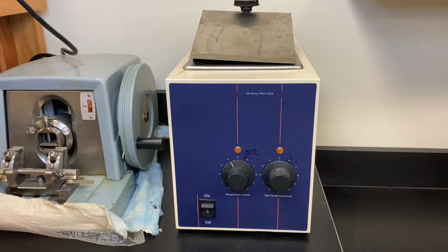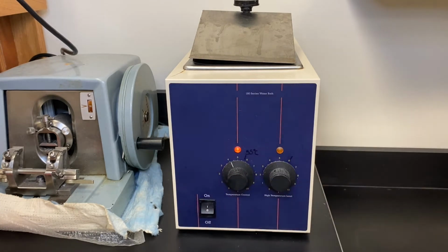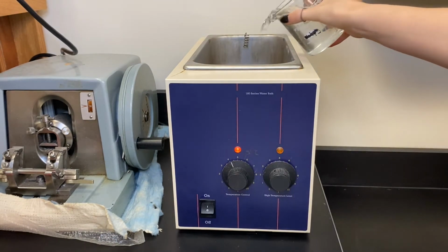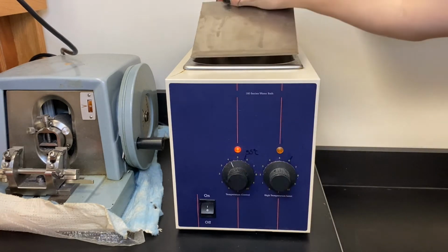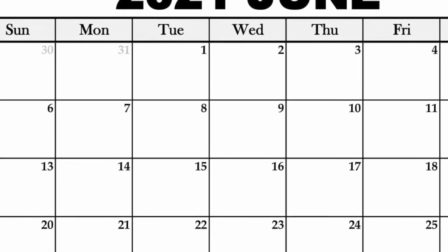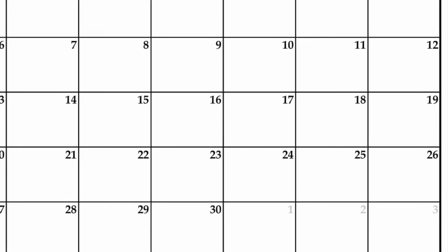While waiting for the DiI to diffuse, I put it in a warm water bath in order to encourage cell membrane fluidity. Typically, we store brains in the fridge to prevent mold and degradation, so setting these slices in the warm water bath is taking quite a gamble, especially for leaving them as long as I had planned to leave them in. I really had no idea how long to leave the slices in the incubator, but some sources were hinting at as long as a month. I ended up leaving it in for 3 weeks.